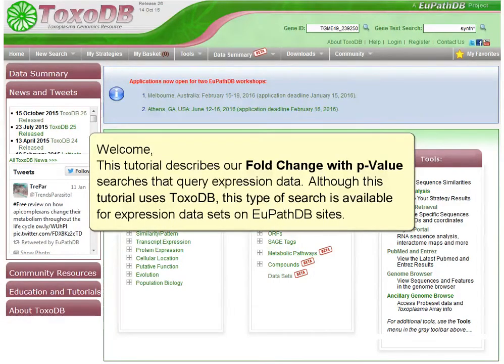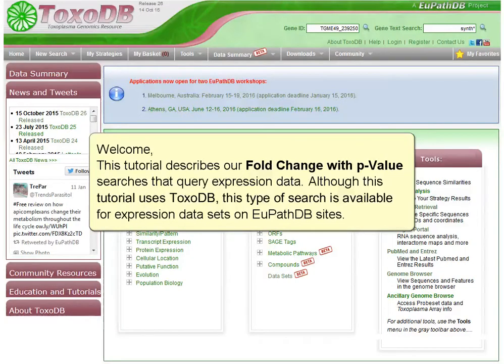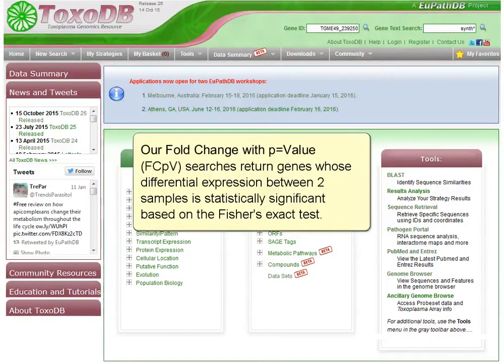Welcome. This tutorial describes our fold change with p-value searches that query expression data. Although this tutorial uses ToxoDB, this type of search is available for expression data sets on EuPathDB sites. Our fold change with p-value searches return genes whose differential expression between two samples is statistically significant based on Fisher's exact test.